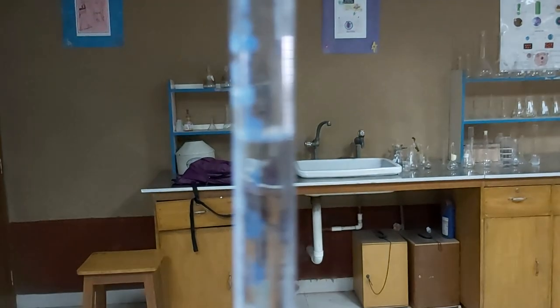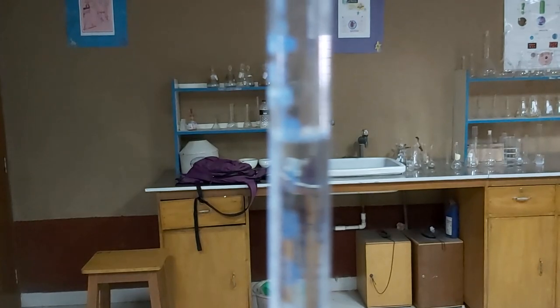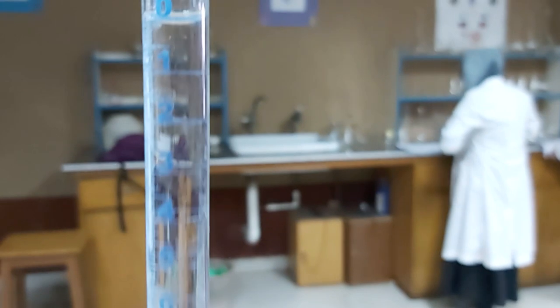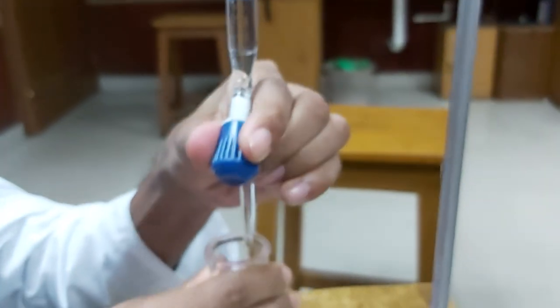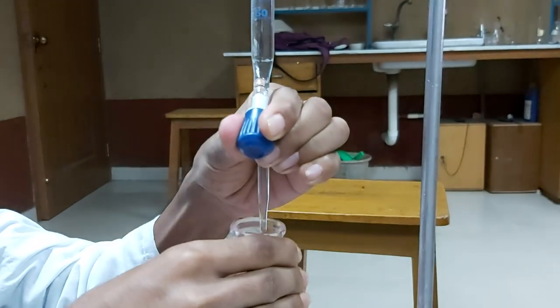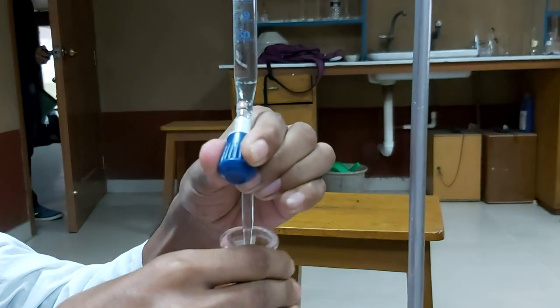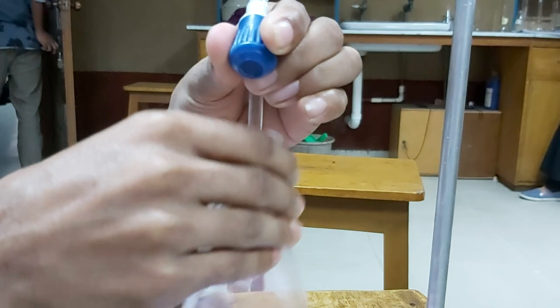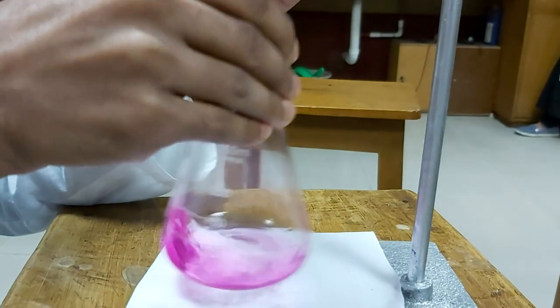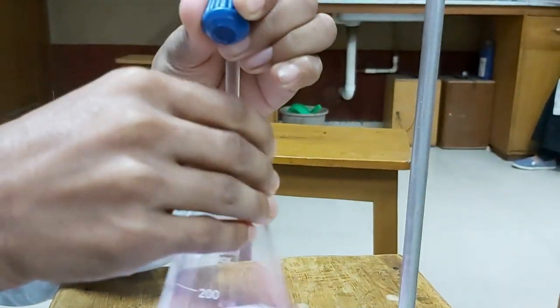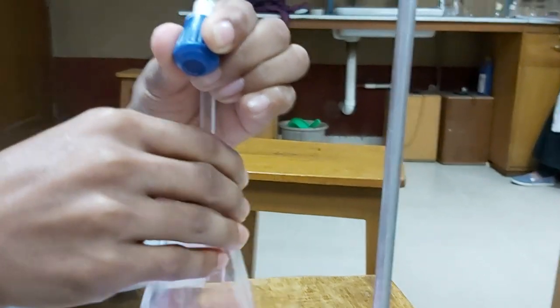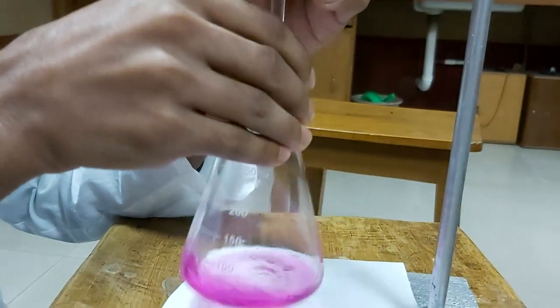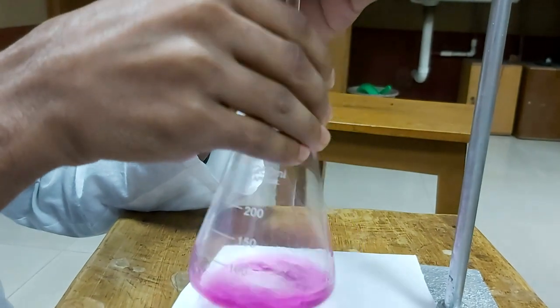The person titrating has taken his left hand on the knob of the burette and the conical flask in his right hand. After addition of each drop of titrant to the analyte, he is shaking so that it can react simultaneously.